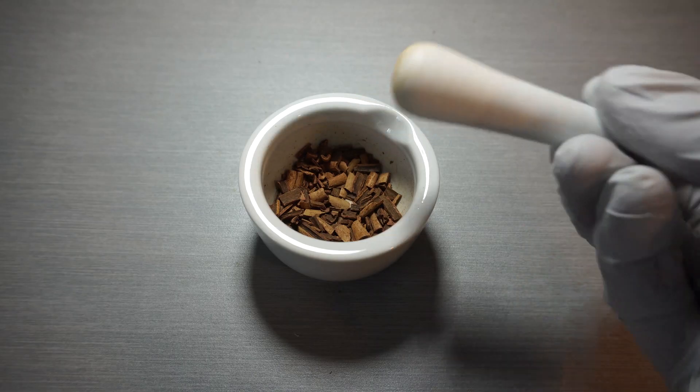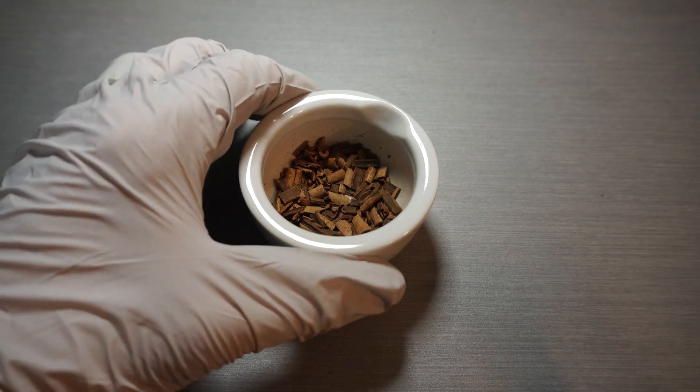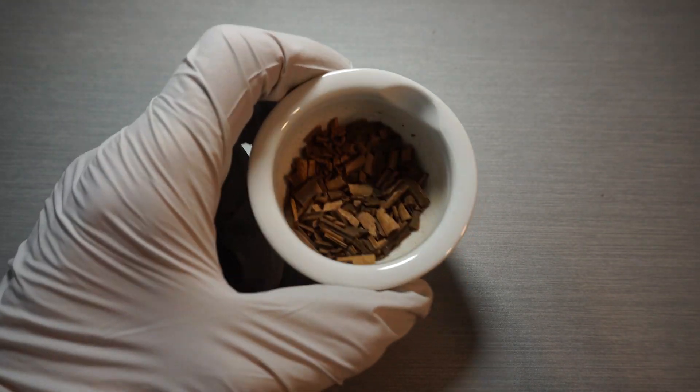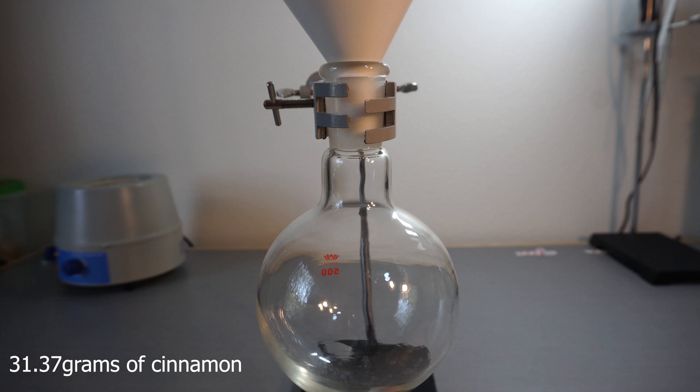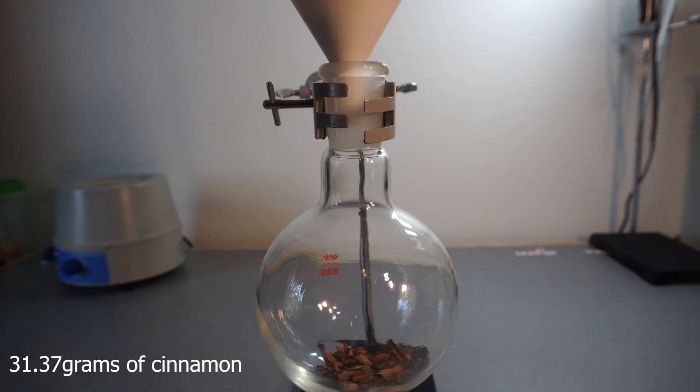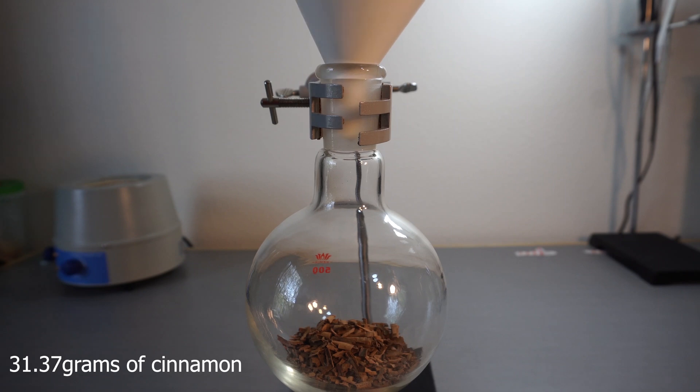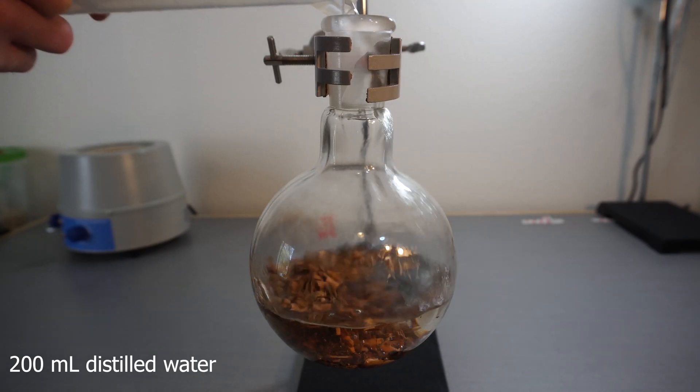We grind down the cinnamon, and we want to avoid grinding it into dust because this will make the distillation foam and cause a possible overflow. I ended up grinding down about 32 grams of cinnamon and added it to the boiling flask, followed by 200 milliliters of distilled water.